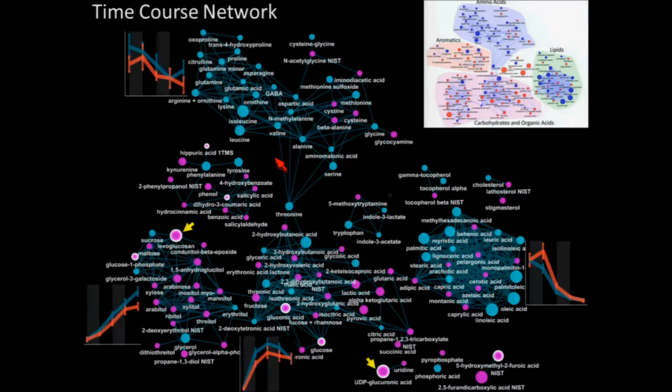For instance, if I go to the amino acids and I look at what's biggest, what's most importantly changed, well, I see isoleucine and leucine right here. And these are two branched-chain amino acids, which are noted biomarkers for type 2 diabetes. And then also, free fatty acids are very much decreased. So these species are very responsive to glucose. And so as you can imagine, when there's a dysregulation in insulin sensitivity, you're going to have an overabundance of these in your plasma. Okay, so this is very nice, very powerful, and allows you to see all of your information and ask questions and shows you patterns.